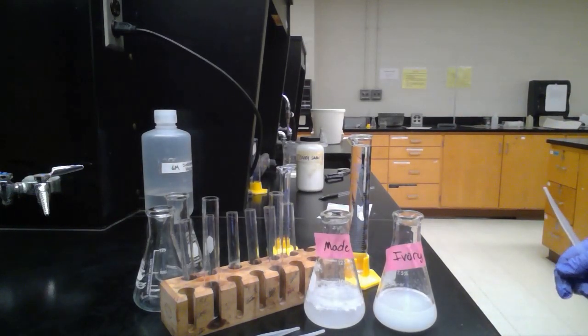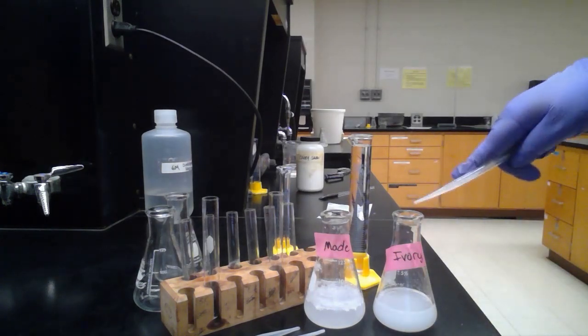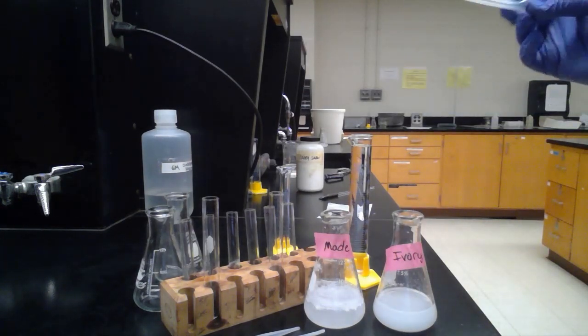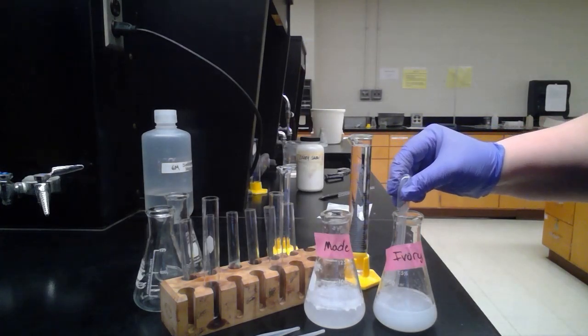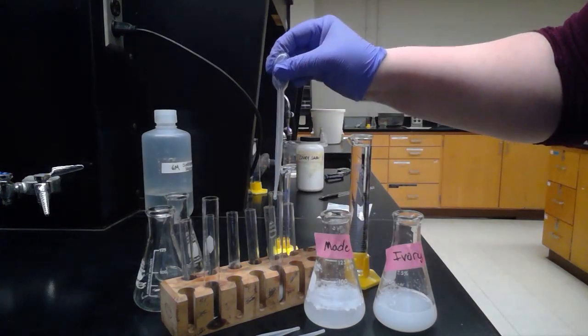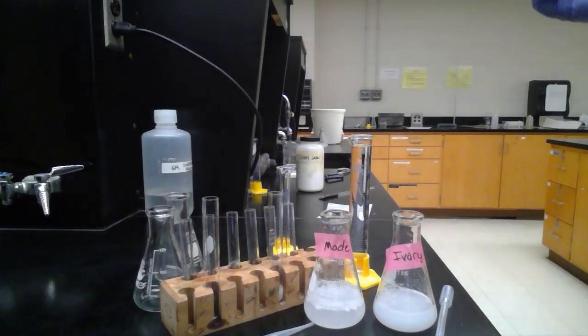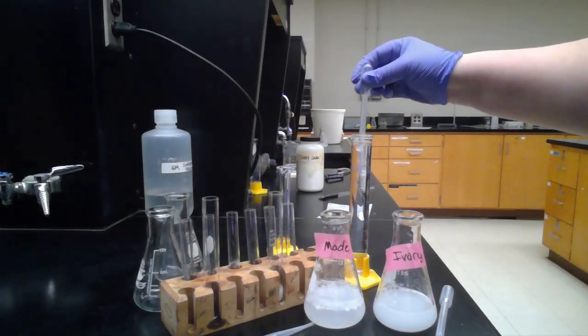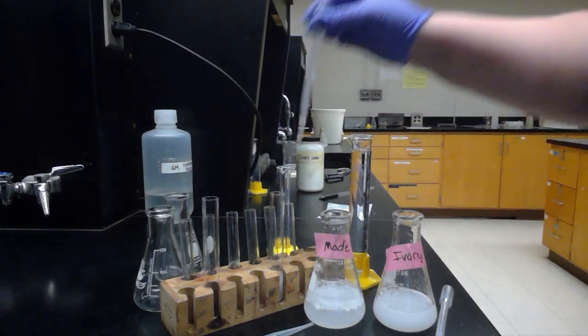Now I'm going to do the foam test. We're going to take one full pipette of our ivory soap, the control soap, and put that into a medium beaker. I'll pull up one full pipette sample of that, and then I'm going to add three full pipettes of distilled water to my medium-sized beaker.